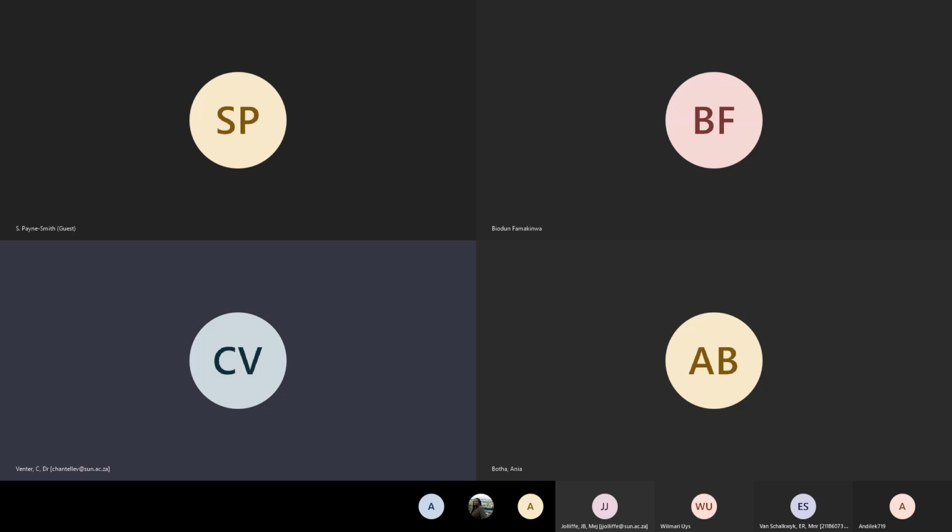Another question asks if I have experience in histology done on insects. Not histology itself. I've done a few studies with students that viewed the insects with the scanning electron microscope, and some also with the confocal. For the SEM, for example, they viewed the surface of the insects. And another type of study looked at the different characteristics of the insects to be able to classify them in their families and groups.